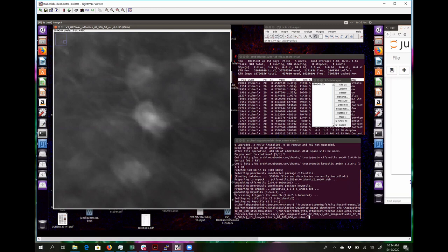But just keep in mind that your resolution's worse. So then you'll actually have Z overlap of cells. Okay, so now how do you draw these ROIs? There's one approach, which I think I've seen maybe a couple of papers doing, which is to just not count them. If you're towards the periphery, just ignore the cells, like just move on.